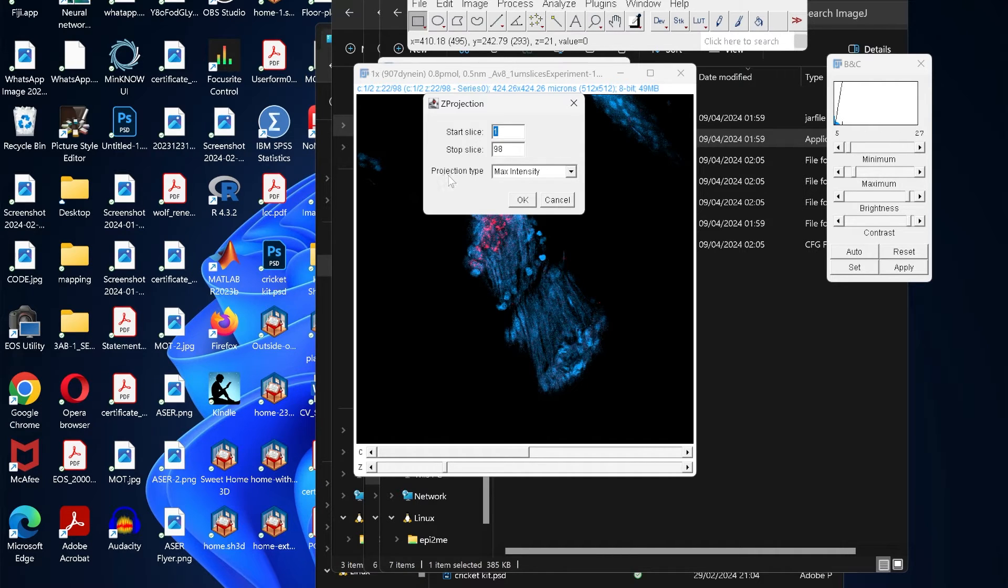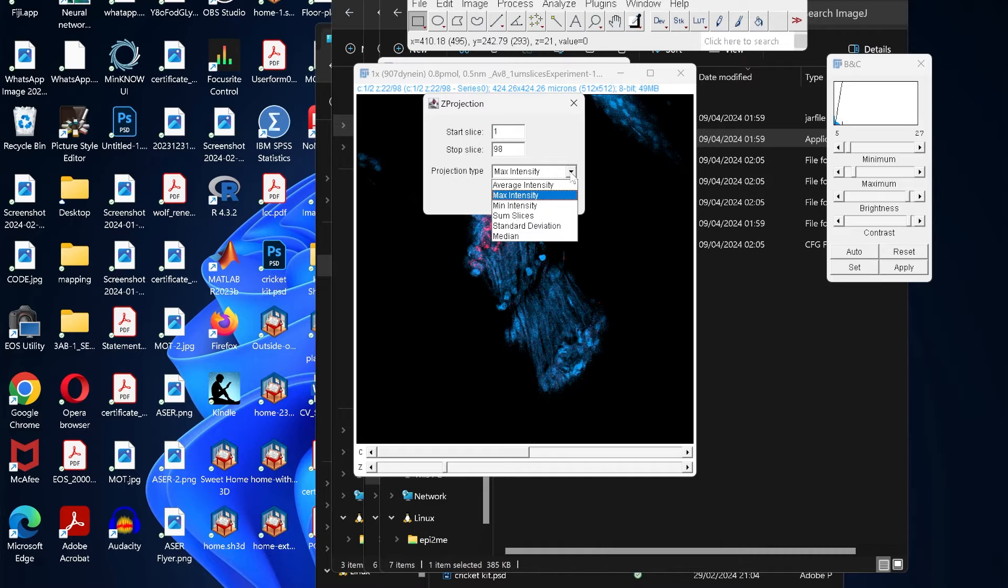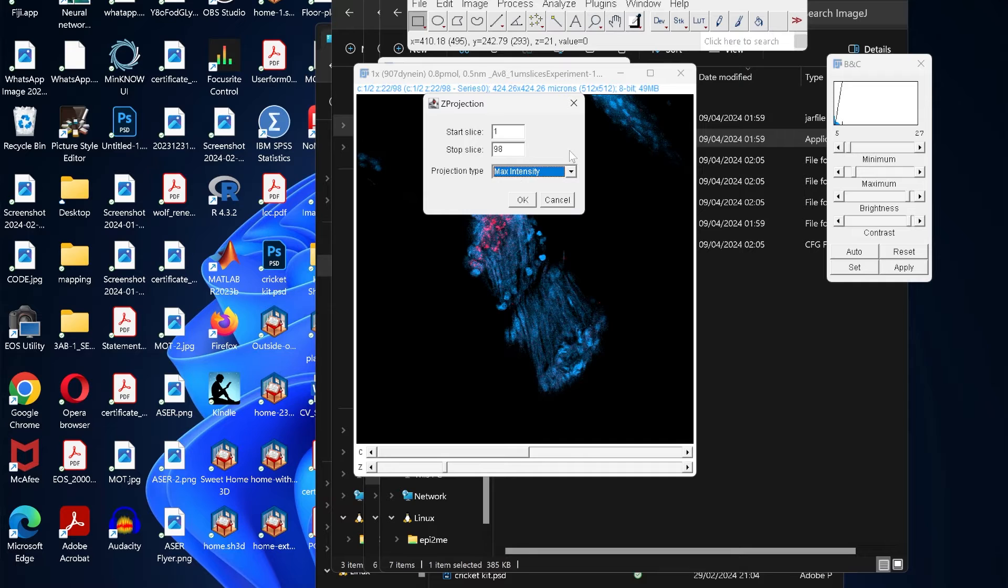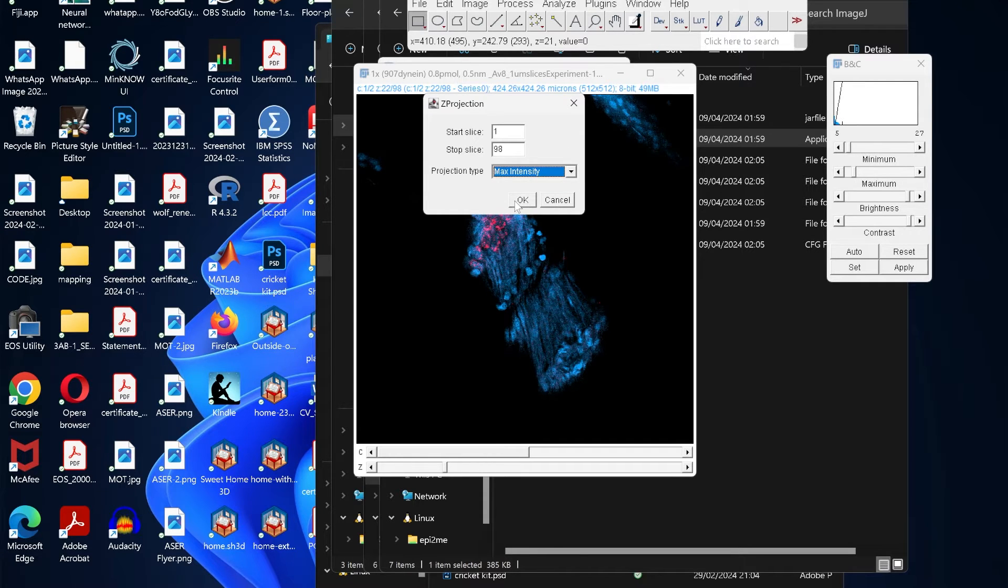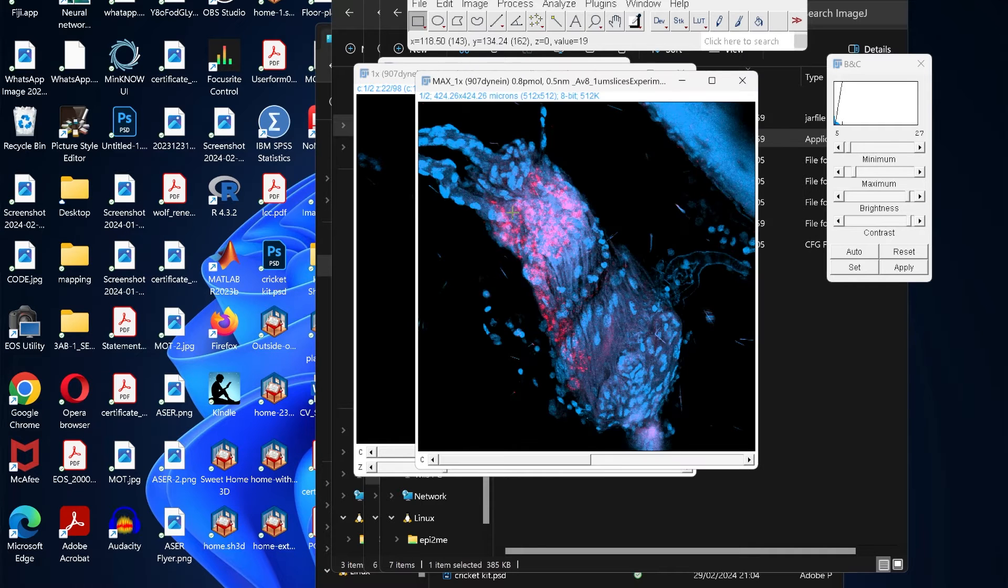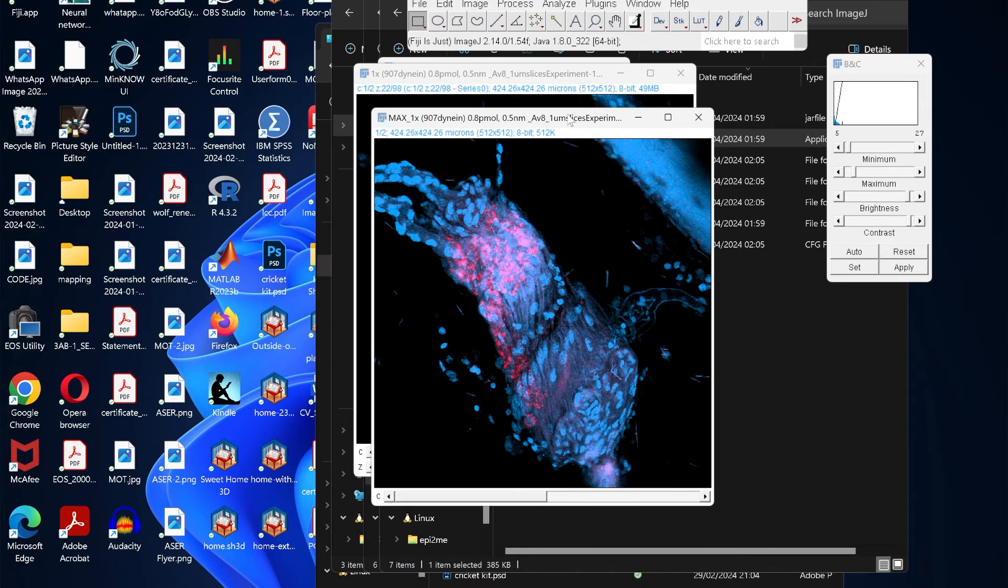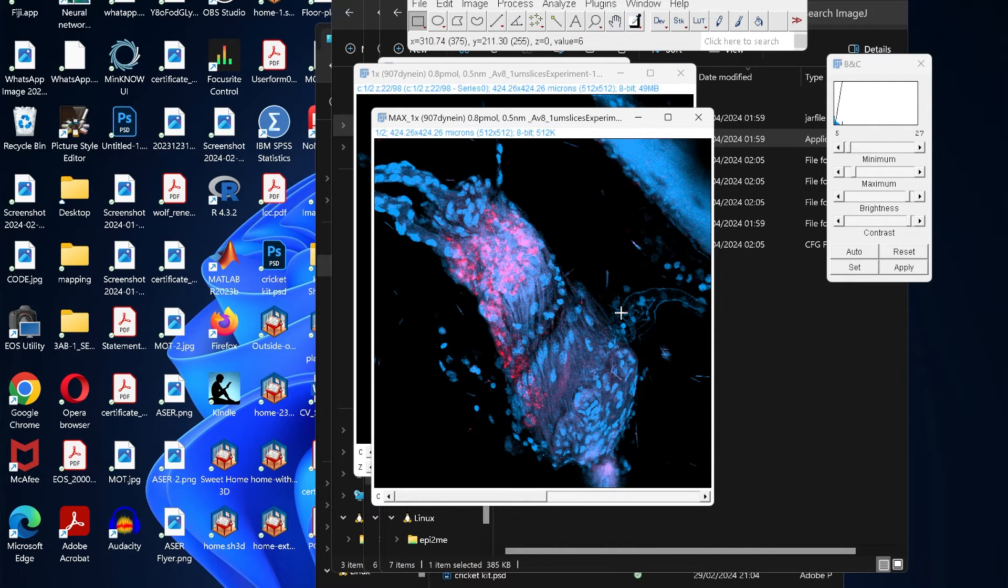At the bottom it's asking about the projection type, and here we have various options: average intensity, maximum intensity, minimum intensity, and other options. It's good to use the maximum intensity, although you can try other parameters as well. Choose the maximum intensity, then click OK, and here you get your final flattened image which is a single layer.